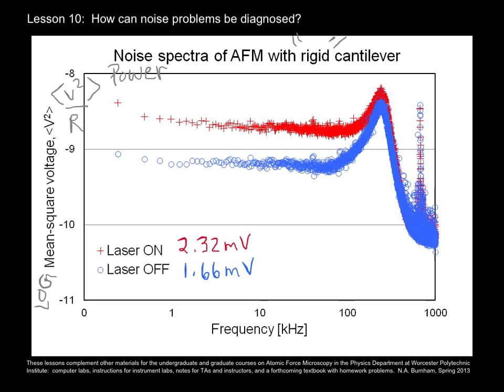Now I want to tell you about some of the characteristics of these spectra. They have all the typical kinds of things happening in noise spectra. And we'll work left to right. So first of all, please note these 2 points here. The slope of those 2 points is -1 on a log scale. Okay?